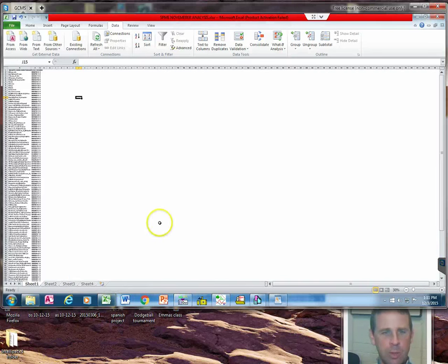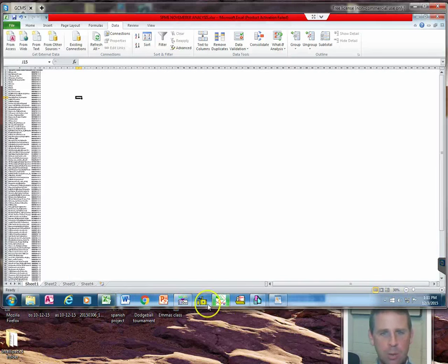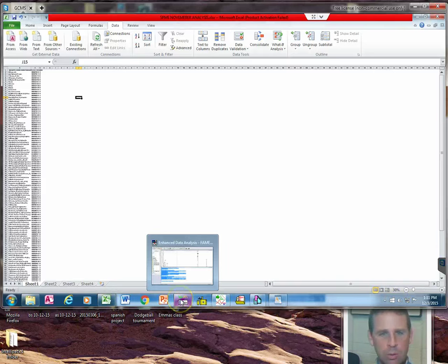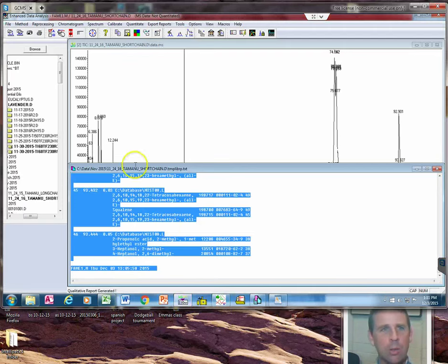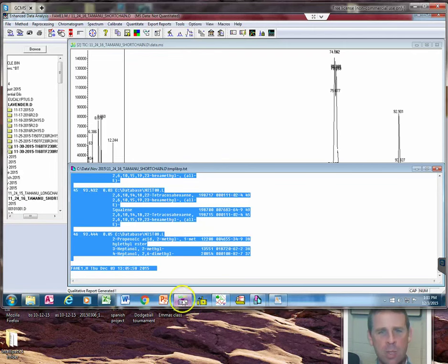Alright, so here's what we're going to do. We're in the GCMS computer here.